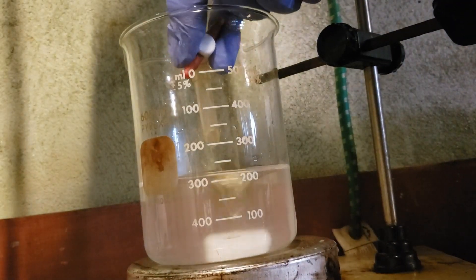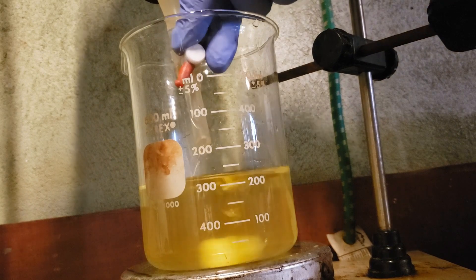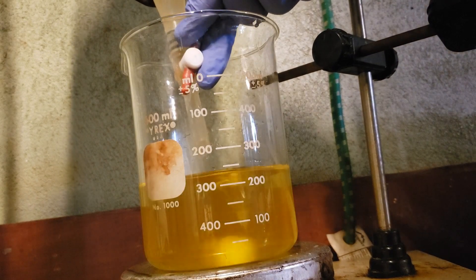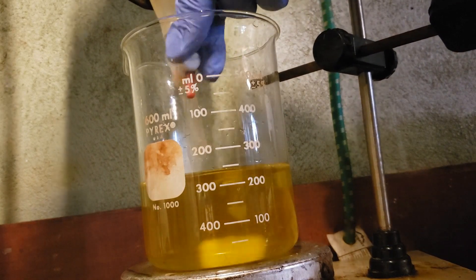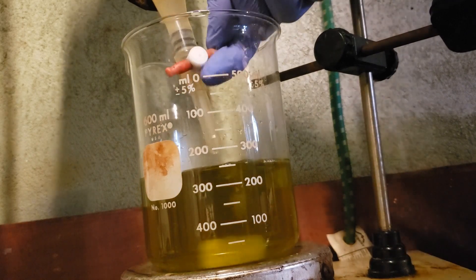Hi everybody. In this video we'll be producing molybdenum blue, an interesting compound by the ascorbate reduction of ammonium heptamolybdate. This will be a pretty short video and I won't list out the reagents, so let's get right into it.